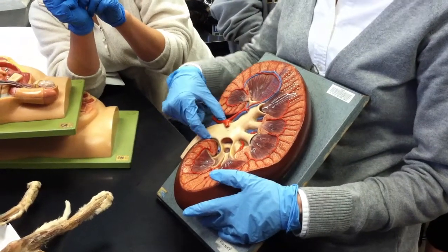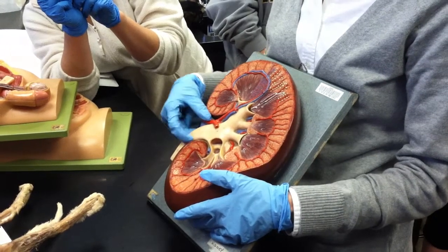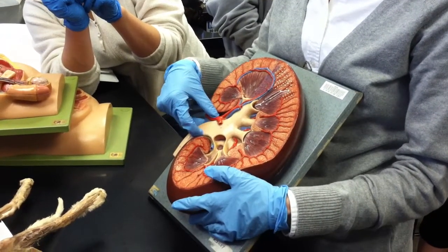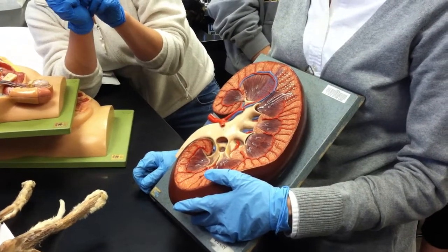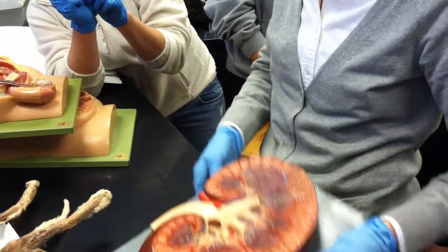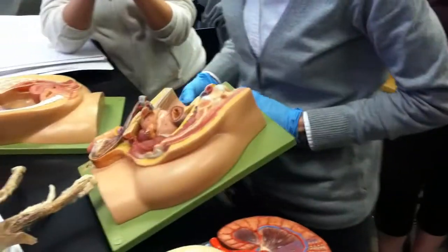Okay, where the ureter exits the kidney is also the same space where the artery and vein exit the kidney, and that's called the hilus. Good? Alright. That's our kidney. Now we can do our boy.